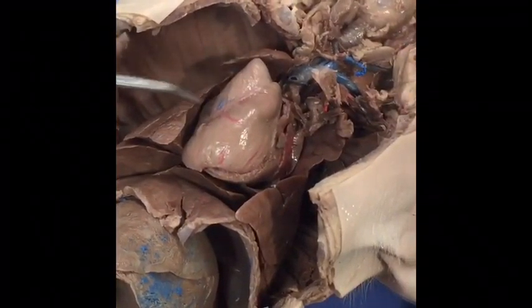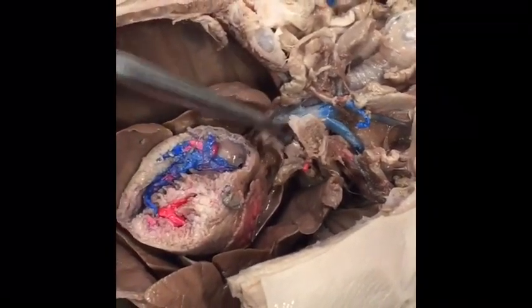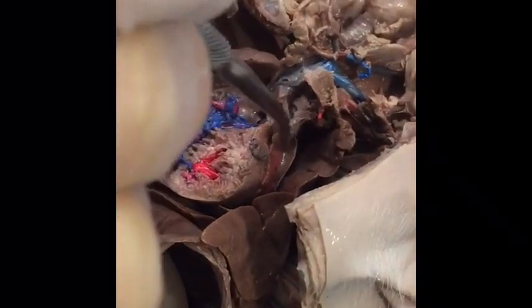So the heart basically pumps the blood throughout the body. The coronary artery supplies blood to the heart muscles. The aorta begins at the left ventricle, and it's the muscular pumping chamber. The superior and inferior vena cava: the superior brings blood to the heart from the top of the body, and the inferior brings blood from the bottom of the body. And then the renal artery and vein: the artery carries blood from the heart to the kidney, and then the vein brings blood from the kidney to the heart.